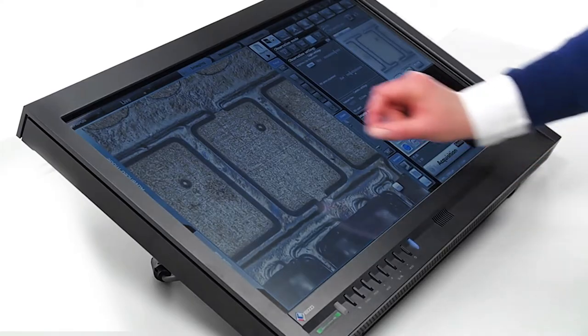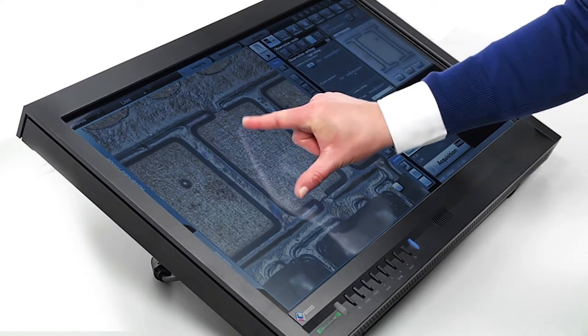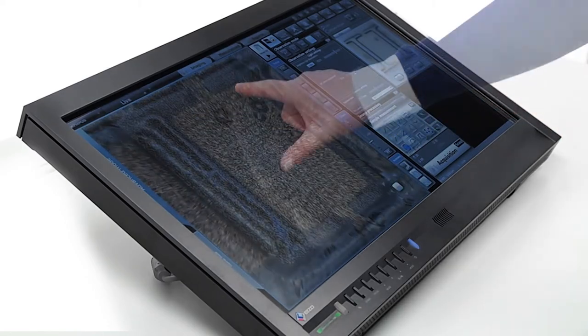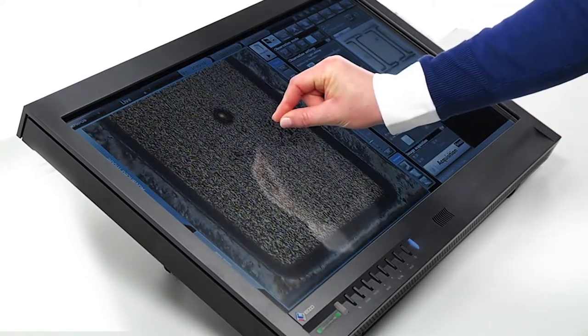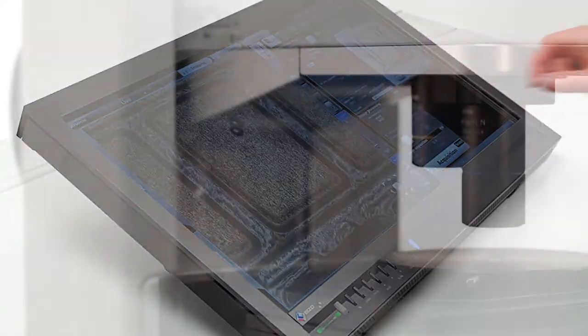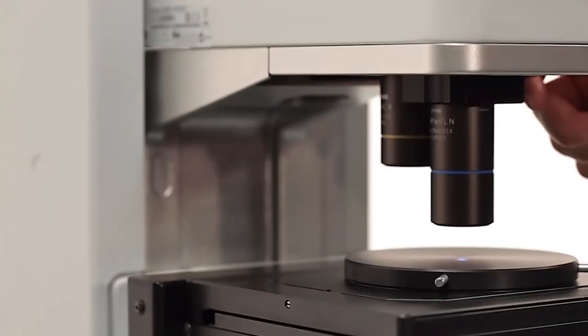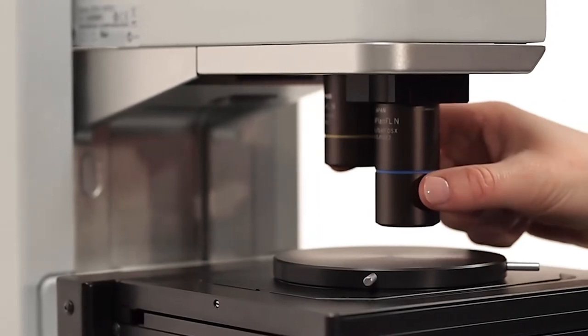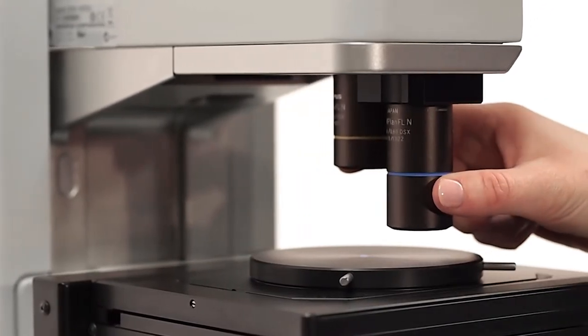Zoom in and out on your sample with a simple pinch or un-pinch. The DSX's telecentric lenses are optimized for zooming so you never have to refocus.